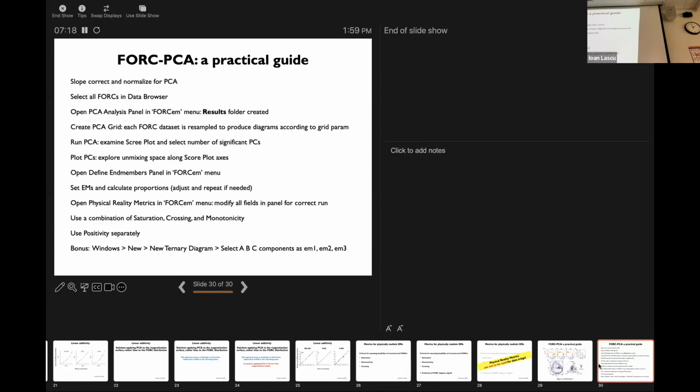Okay. Yeah, I have a comment that follows on nicely from your question. I think that really all the end members are parts of the fork diagram that co-vary together. So there's no reason that an end member has to be a pure mineral or a single domain state. It's just looking for parts that co-vary. So even if you're getting end members that are mixtures because of how big you've made that mixing space, in reality your end members could actually be mixtures.